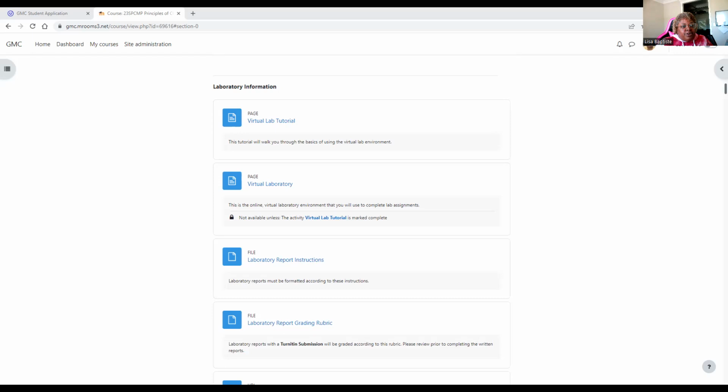So I'm going to just go through the first part and we'll look at the instructions. And this is going to be on the Moodle homepage, so you can follow along at any time. On your scale balance, there's this tare button.